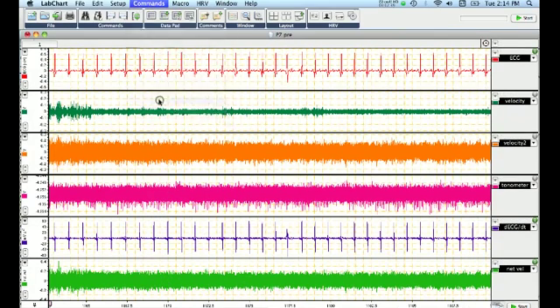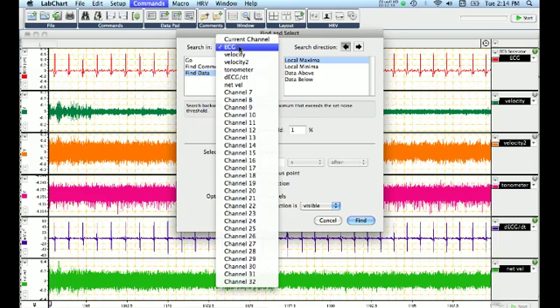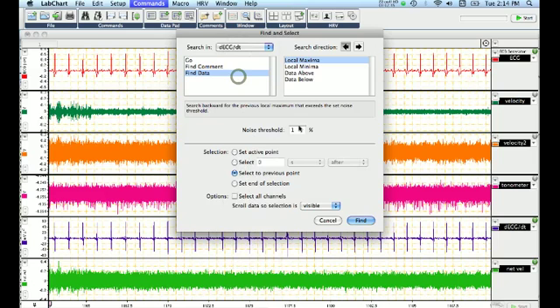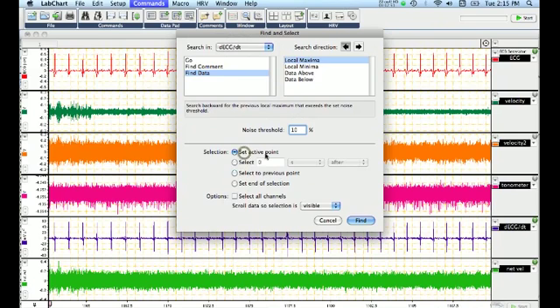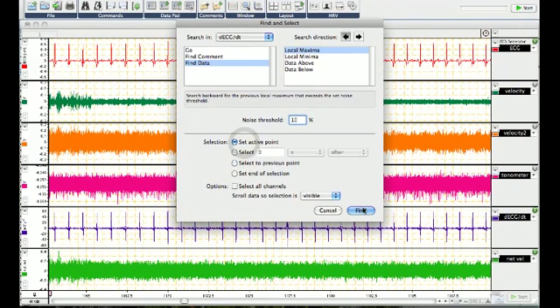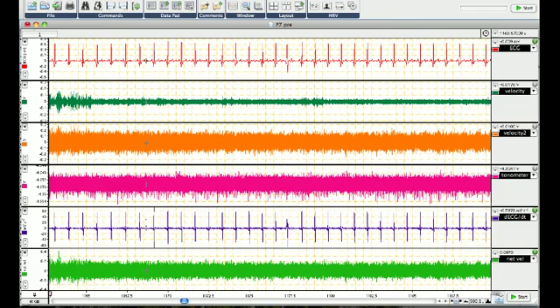So on this particular time of looking and finding data, we go to the derivative channel, look for a noise threshold, let's say about 10%, and we set it as an active point, and click Find. And if you'll notice, the cursor moved from in between these two beats to locate this particular beat.